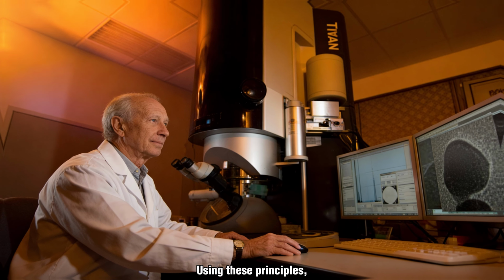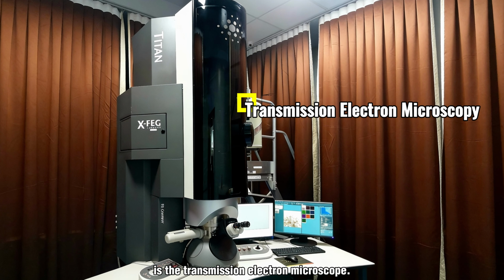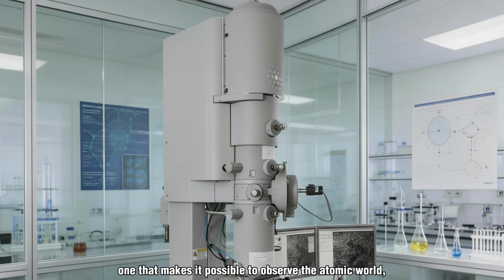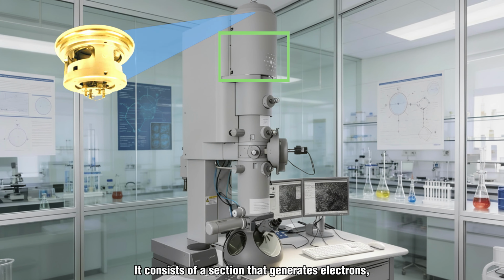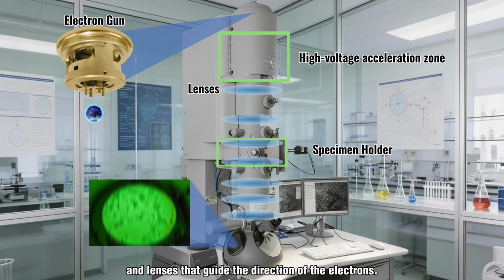Using these principles, the ultimate instrument that allows us to directly observe the world of atoms is the transmission electron microscope. Because a transmission electron microscope is such a remarkable instrument, one that makes it possible to observe the atomic world, its size and structure are equally impressive. It consists of a section that generates electrons, a section that accelerates those electrons to extremely high speeds, and lenses that guide the direction of the electrons.